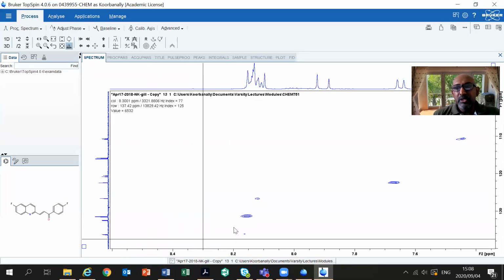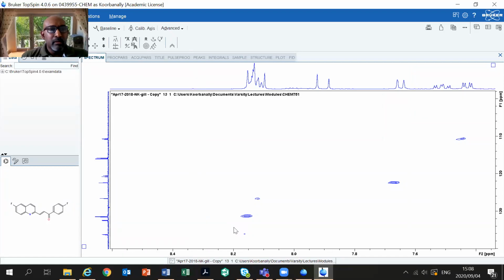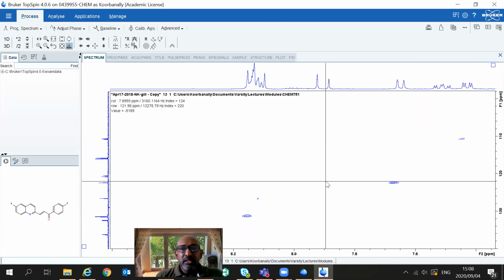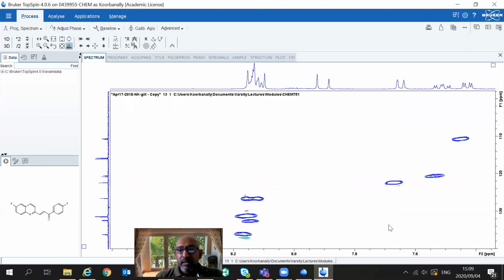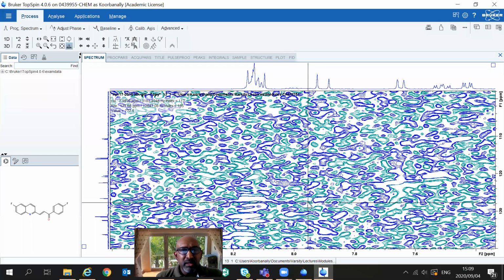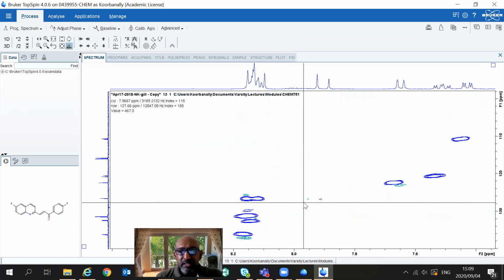And have a look at that particular region. What I can actually see now is, if I increase my intensity here, that these peaks are quite pronounced. I can also increase the noise. As I said, now I see all the houses, all the rooftops, all the rivers and everything else. And now I'm decreasing it just by using my roller on my mouse.